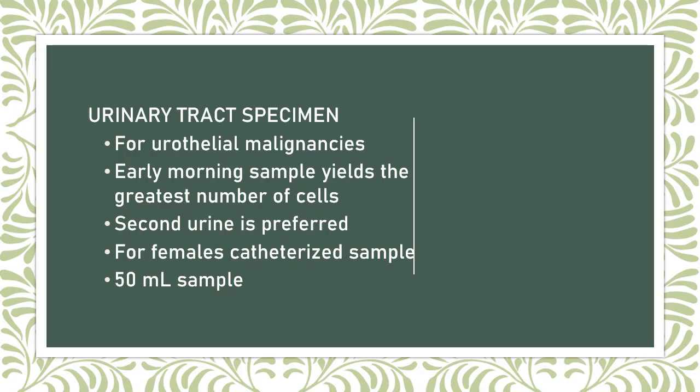Next, your urinary tract specimen. This is used for urothelial malignancies, but not only for those; it is also used for pathologic infectious microorganisms present.